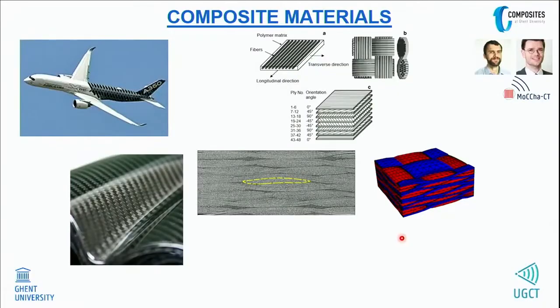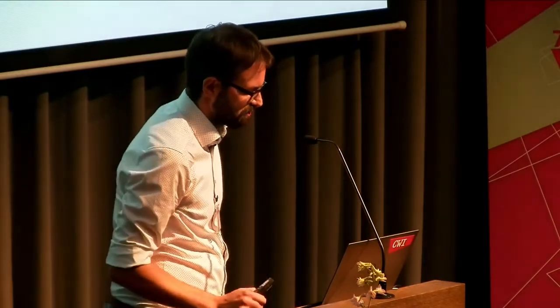But of course, it is very interesting to really see the structure of that carbon fiber and those yarns of the carbon fibers inside those polymers. But that is really challenging. The top one that you see here is made at a synchrotron. So it's still relatively good in terms of quality. If you really go to a lab-based CT scan of these carbon fiber reinforced polymers, it gets really, really tricky to segment out these yarns.